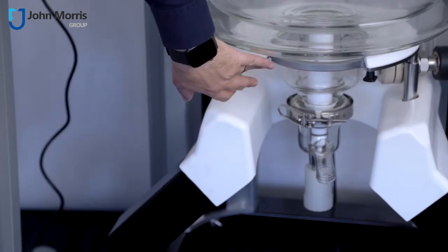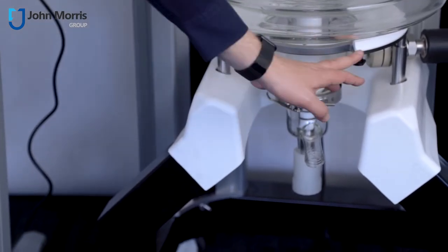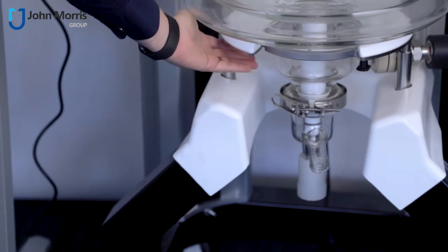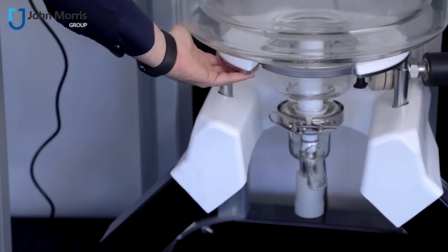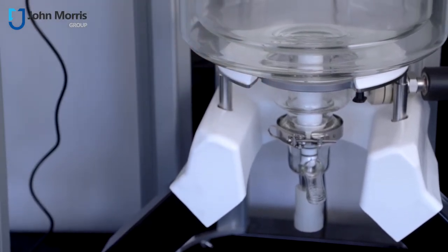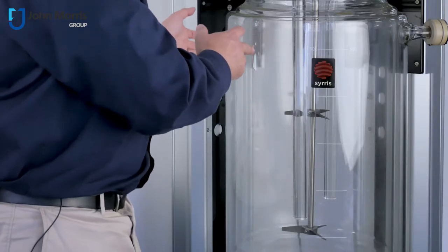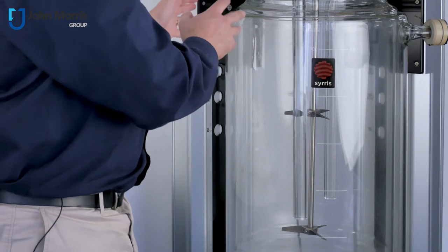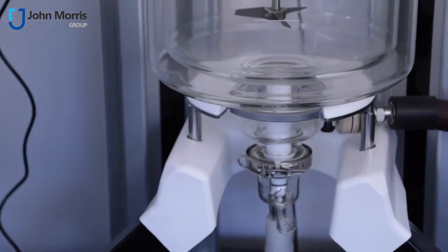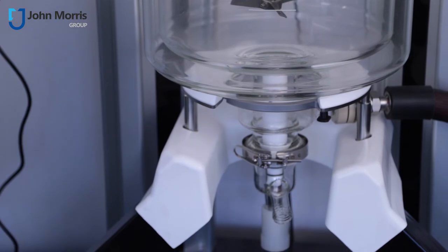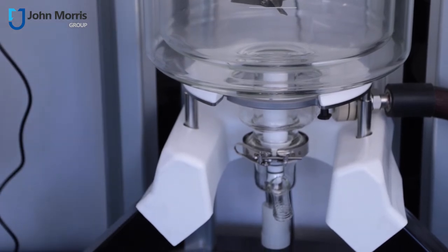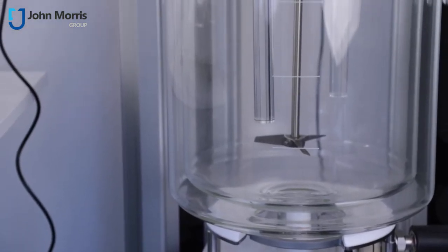I also want to emphasize some occupational health and safety devices here. You can see what we have here is kind of like a spring-loaded support mechanism and a vessel like this is usually quite large. You're talking upwards of 30 kilograms and that means you need three or four people really to position it into place. But with this device right here half of the weight is taken on either side so you can have two people to load a vessel just like this.